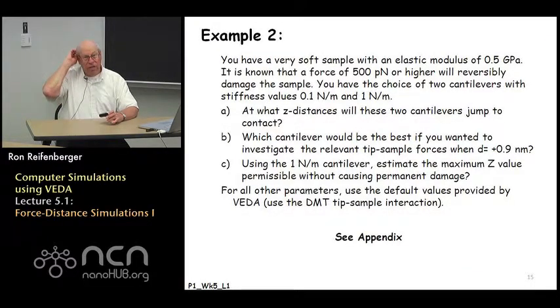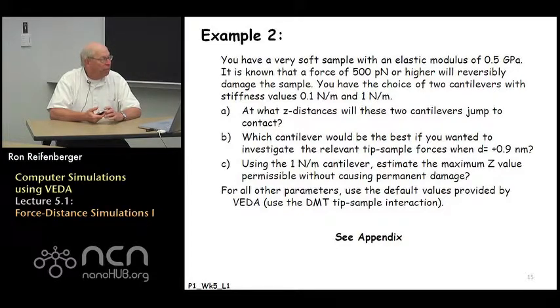I've also included in the appendix a second example. The second example refers to applying a force no greater than 500 piconewtons to a soft substrate which has a Young's modulus of 0.5 gigapascal. I ask a series of simple questions that you might find interesting experimentally, because if you're trying to do an experiment on a soft sample, you certainly don't want to deform it permanently by indenting it.